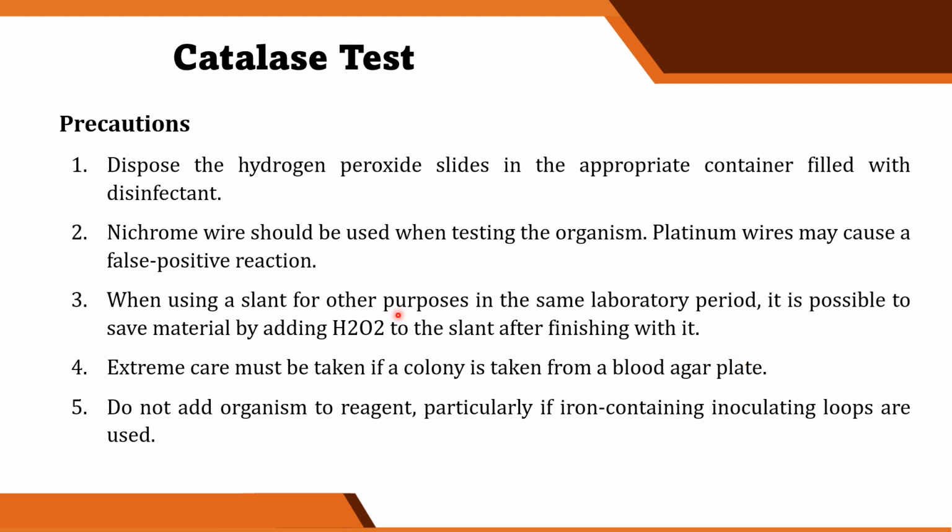Okay? And then, number 4, extreme care must be taken if a colony is taken from a blood agar plate. Ayun. Okay? Kasi, erythrocytes or the RBCs, they contain catalase. Okay? So, a transfer of only a few blood cells, kahit konti lang, can give a false positive reaction. Okay? Kaya, as much as possible, iwasan na lang natin. Pwede tayo kumuha sa other plates. Nutrient agar na lang. Yan. Now, number 5, do not add organisms to reagent. Okay?